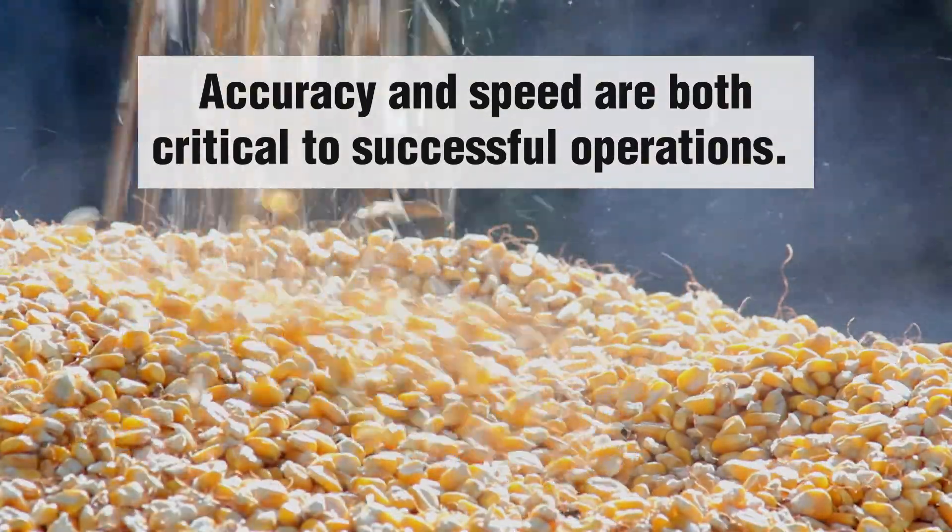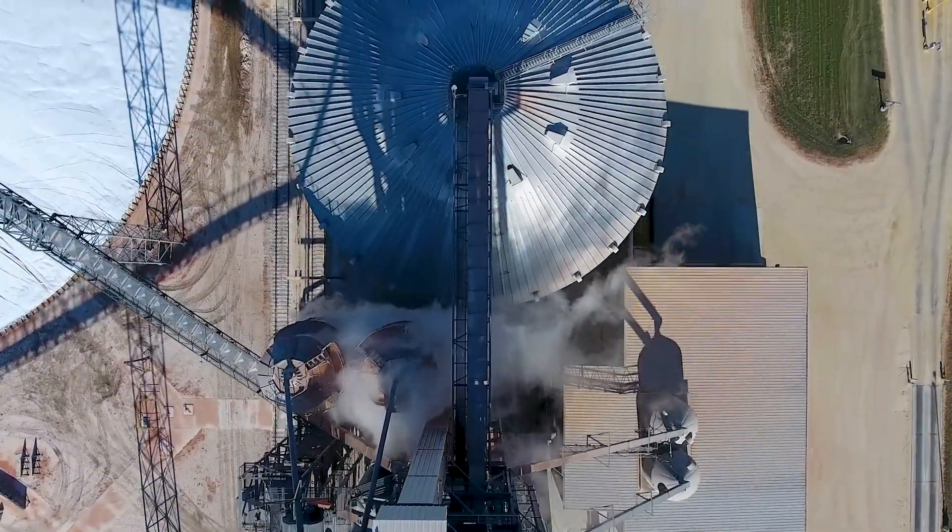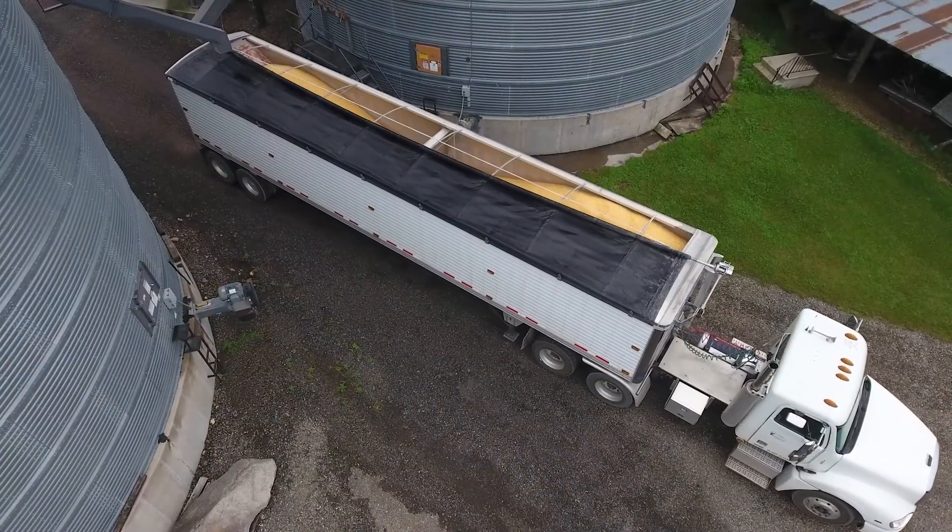Optimum profitability requires accurate measurement of grain for incoming shipments, decisions made during conditioning, the blending and storage process, and outgoing shipments.